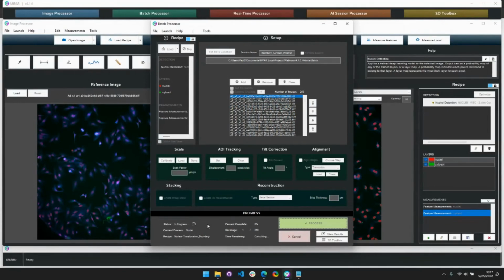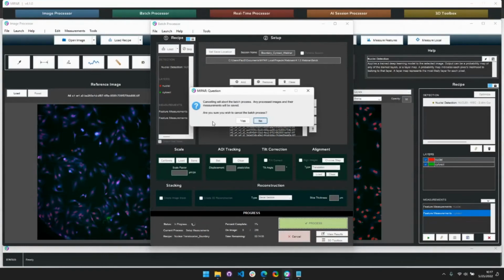And in a matter of, I don't know, a minute, I was able to entirely change the region of interest where I'm looking at my intensities and be able to explore a completely different hypothesis, relying that my detection is going to be accurate, thanks to the powerful tools that the MIPAR has to offer. So once again, I'm going to go ahead and cancel this batch.